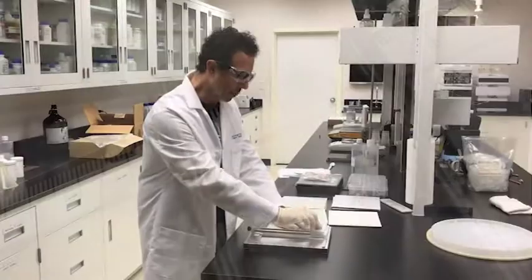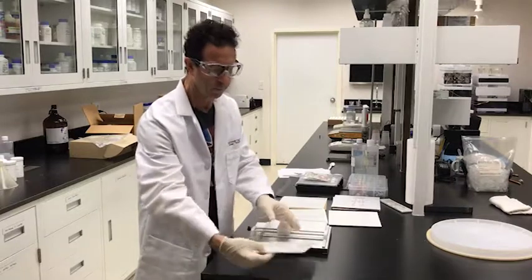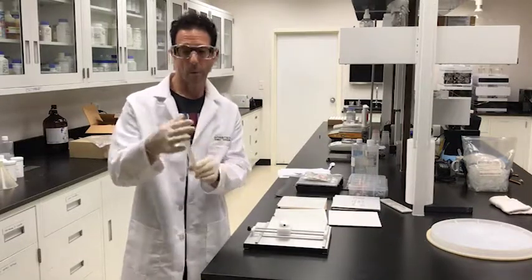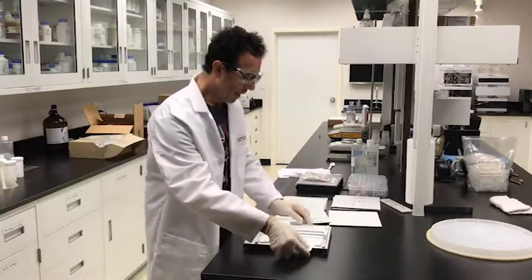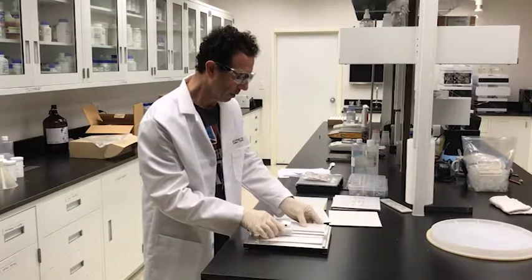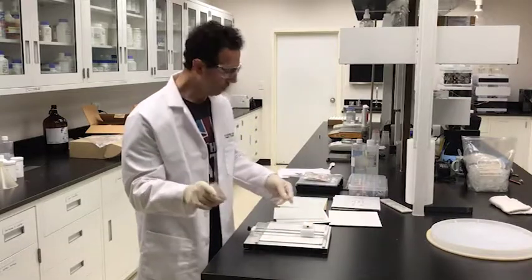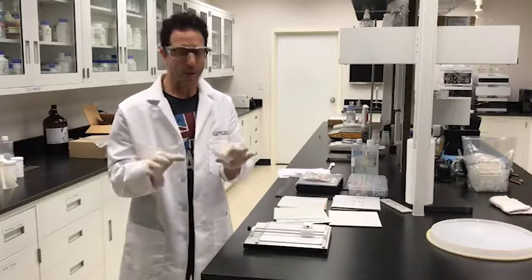You simply push down on the scriber — you can hear the cutting — then move the plate over and easily snap it. Now we've got a two and a half centimeter wide plate by 20 centimeters. We line it up again and come up with roughly seven and a half centimeters, do a little score, and boom — we're ready to go.